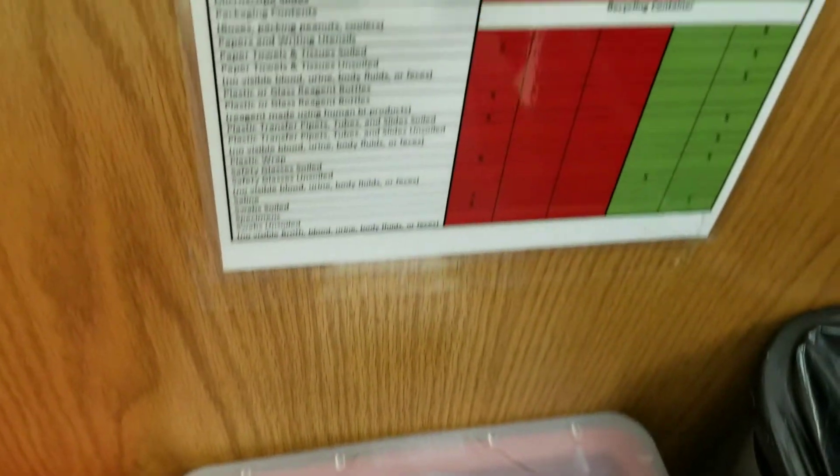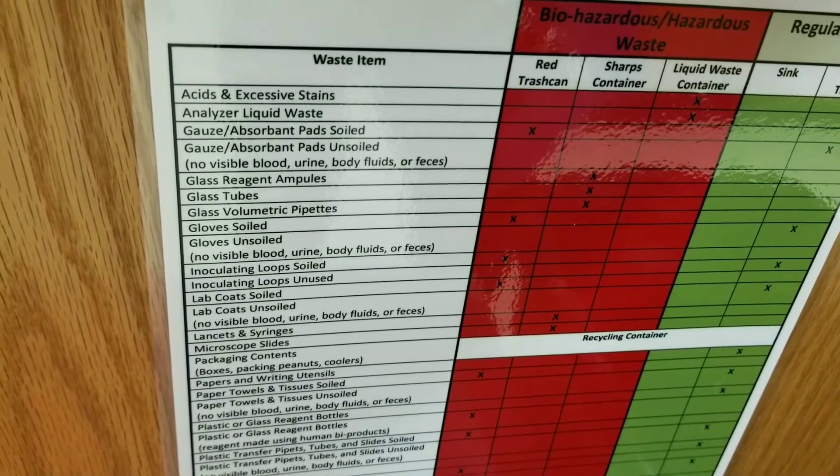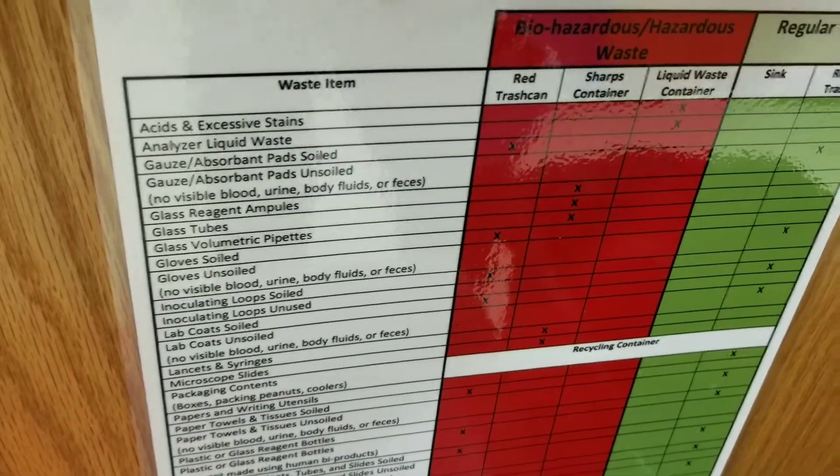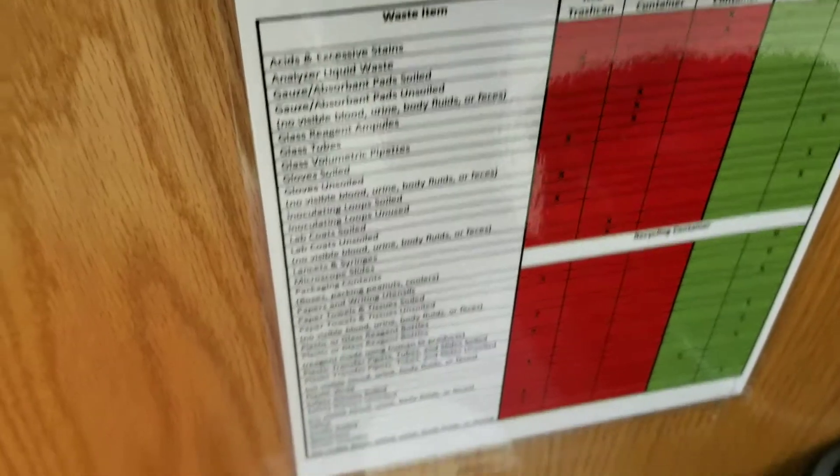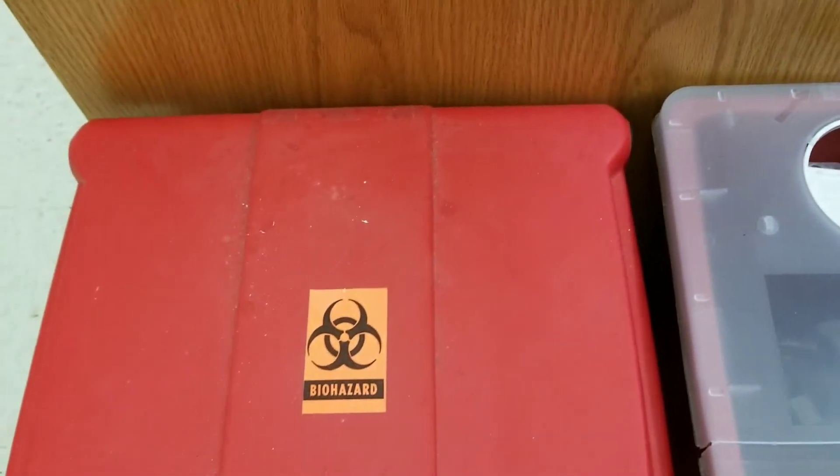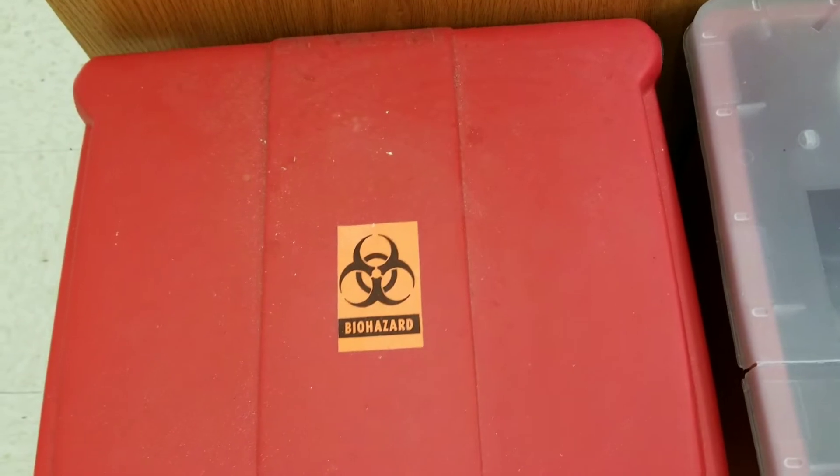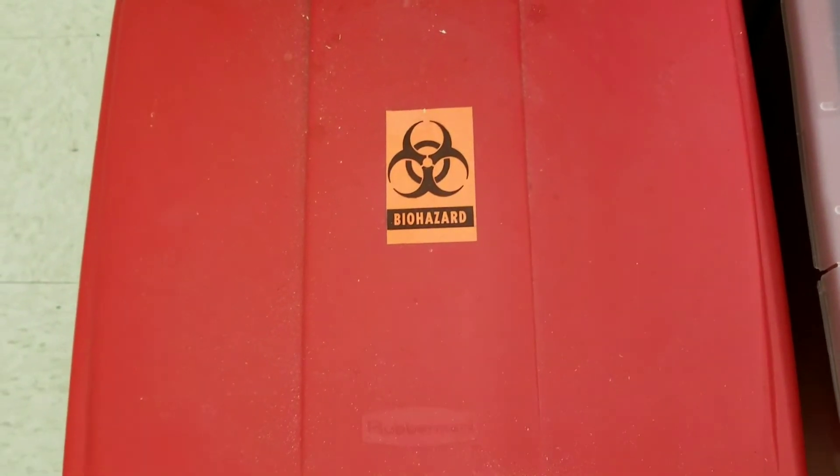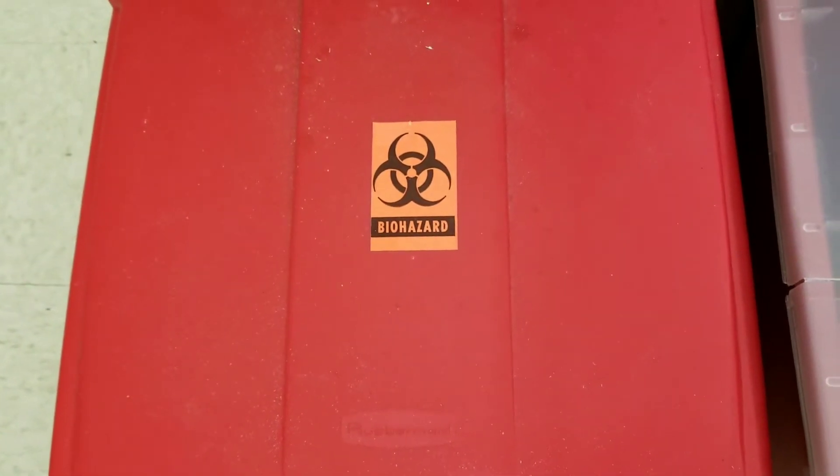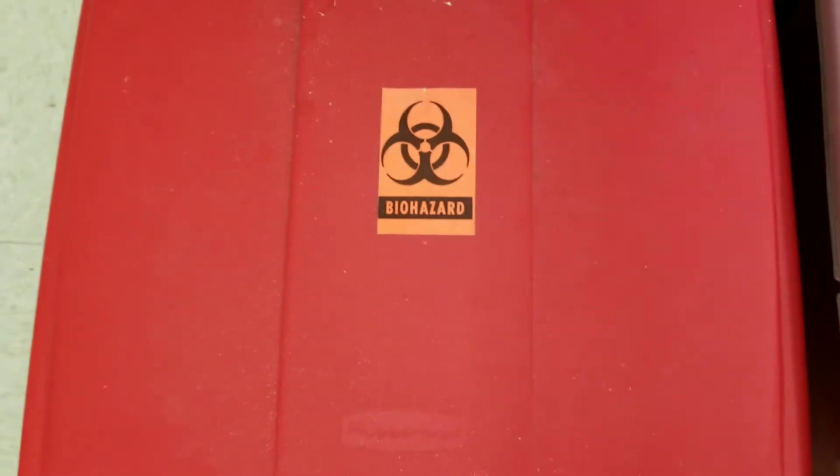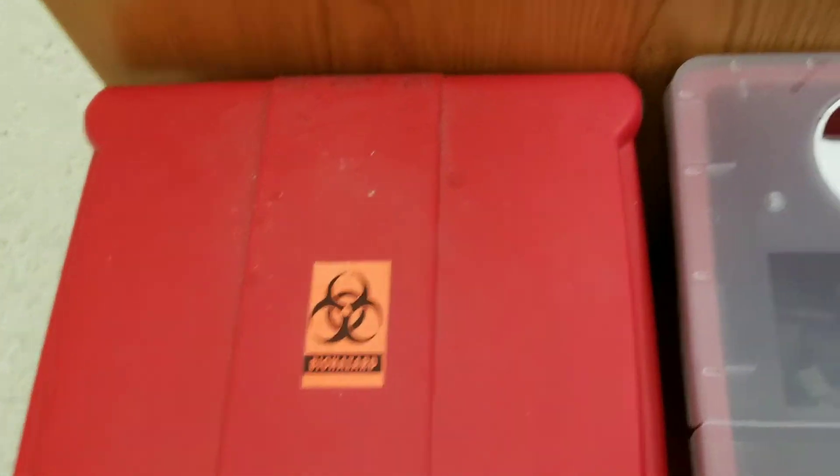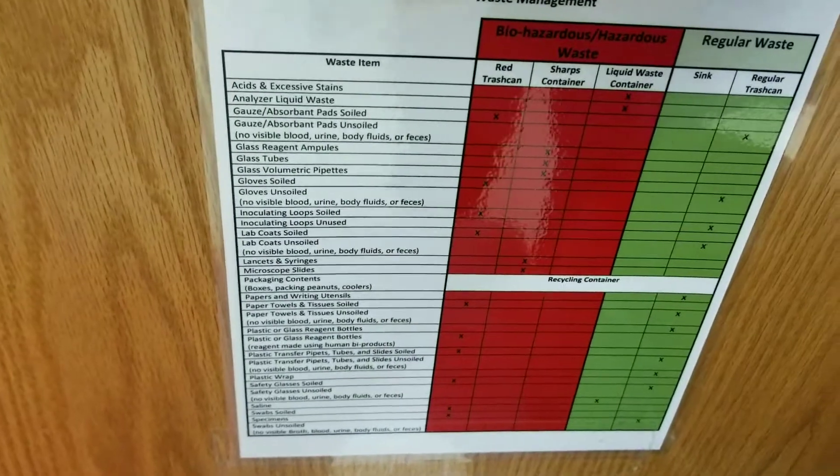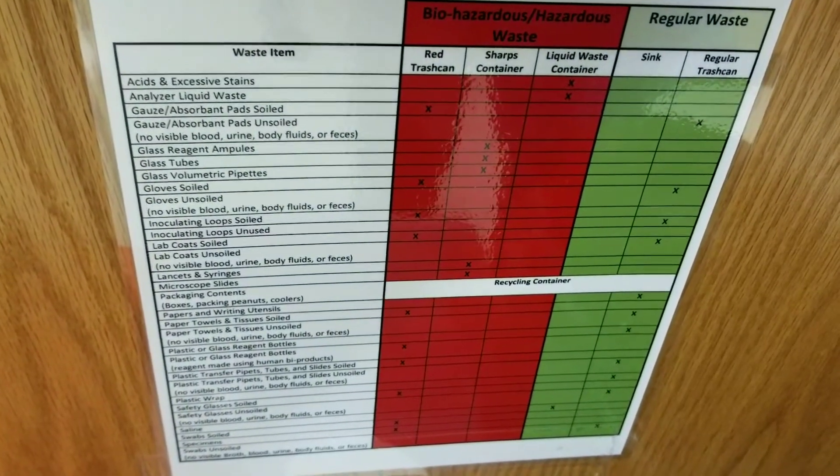Whereas if you look at gauze and absorbent pads, only if they're soiled visibly with something that is biohazardous like urine or blood or feces or anything like that, something that comes out of an animal or a human would go into the red trash can. If it's just water or food coloring or something like that, it's going to go into the regular trash can.